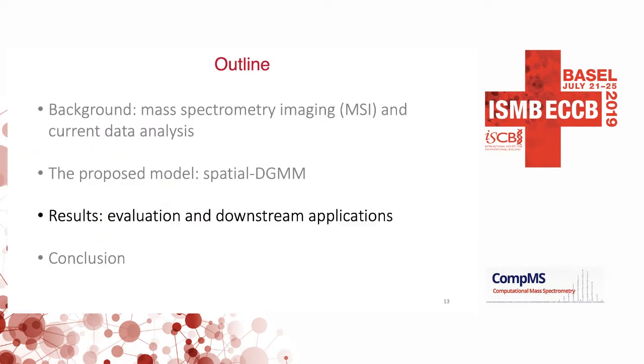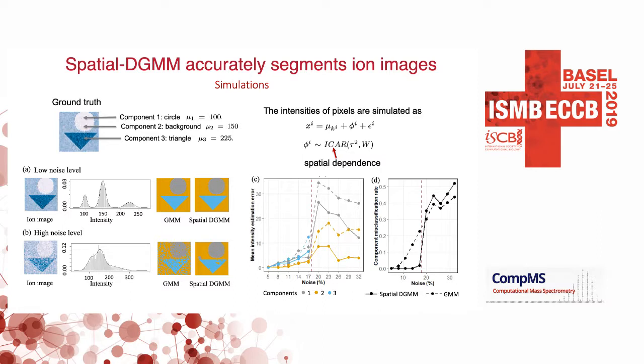Okay, so next I'm going to talk about the results part, including evaluation of the model and its applications in downstream analysis. To evaluate the model performance, we need to know whether the model can correctly estimate the parameters. So here we simulated some ion images with ground truth.